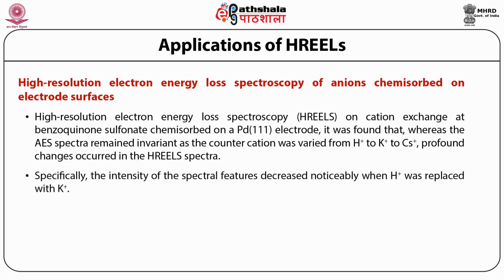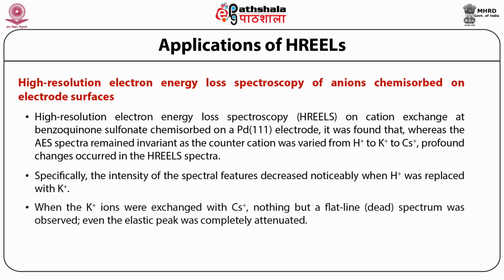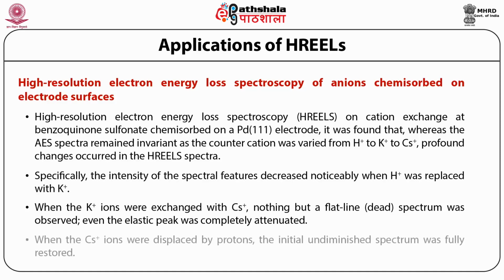Specifically, the intensity of the spectral feature decreased noticeably when H ion was replaced with potassium ion, and when the potassium ions were exchanged with cesium ion, nothing but a flat line, a dead spectrum, was observed. Even the elastic peak was completely attenuated. When the cesium ions were displaced by protons, the initial undiminished spectrum was fully restored.